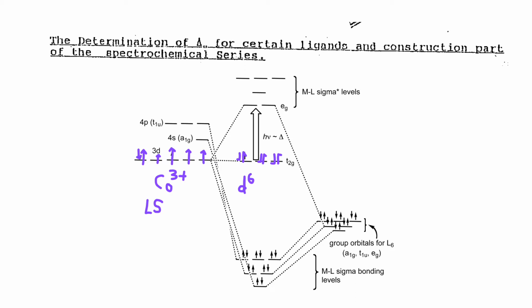Now you start with the cobalt NH3 5 Cl, and you start changing the ligand Cl to H2O to ammonia to NO2, and you record the lambda max, which is the only absorbance because it's A1 to T1, one absorbance, and it represents the delta octahedral.